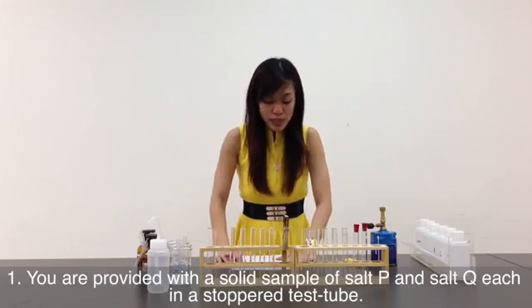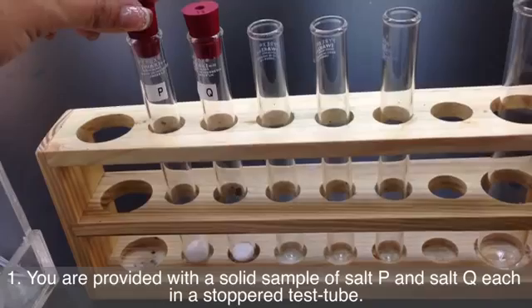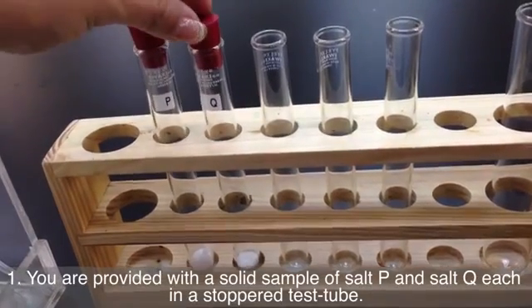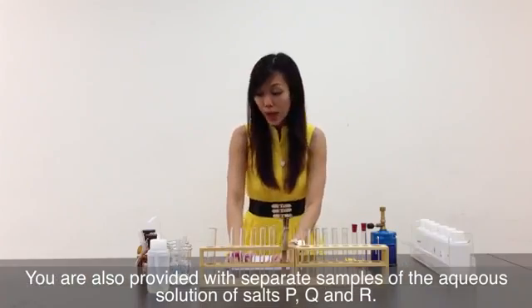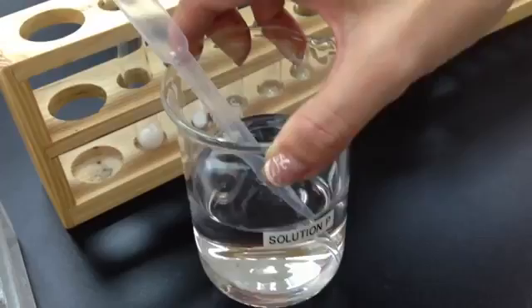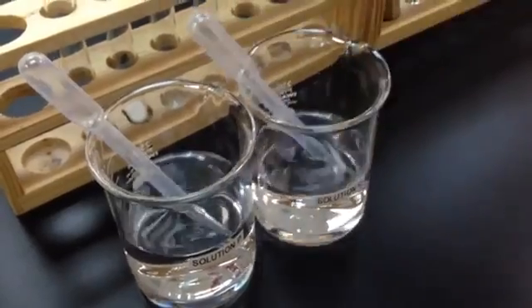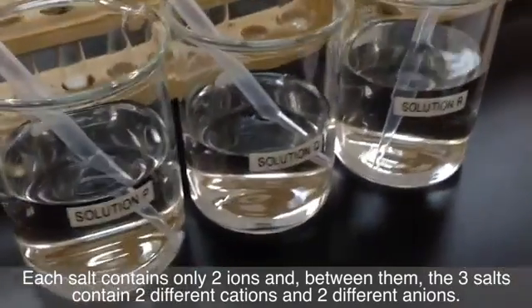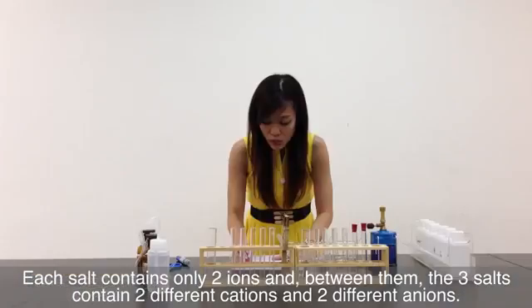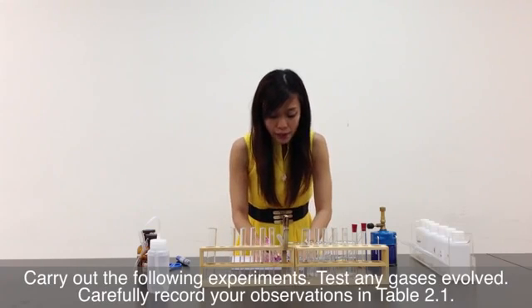It says here: you are provided with a solid sample of salt P and a solid sample of salt Q, each in a stoppered test tube. You are also provided with a separate sample of aqueous solution of salt P, Q, and R. Each salt contains only two ions, and between them, the three salts contain two different cations and two different anions. Carry on the following experiments.